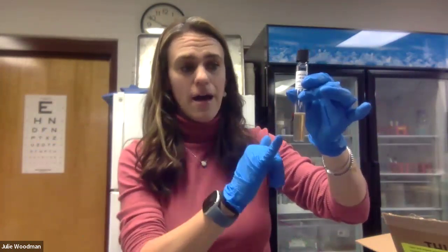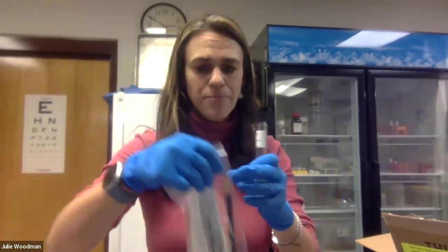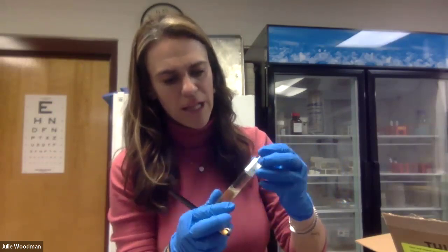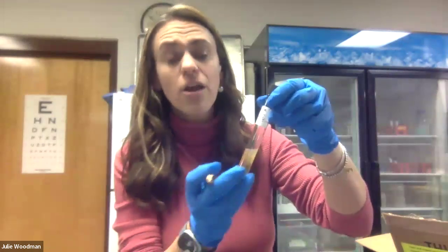One other thing you want to be sure to do — and it would have been good to do before transferring the culture — is label your tube. Your kit includes a marker, and a Sharpie also works. I'm going to write E. coli on the tube so that I know this is my E. coli culture, and when future experiments call for E. coli I know I'm grabbing the right thing.